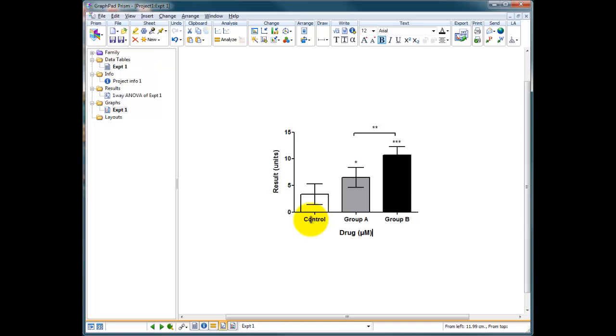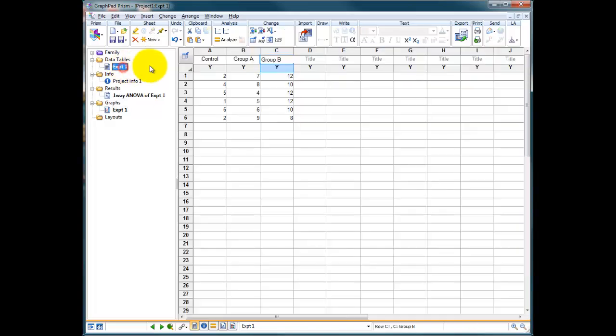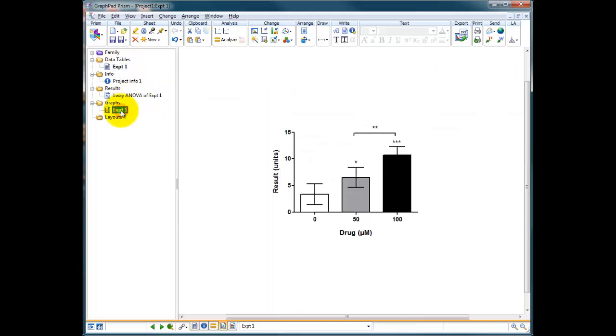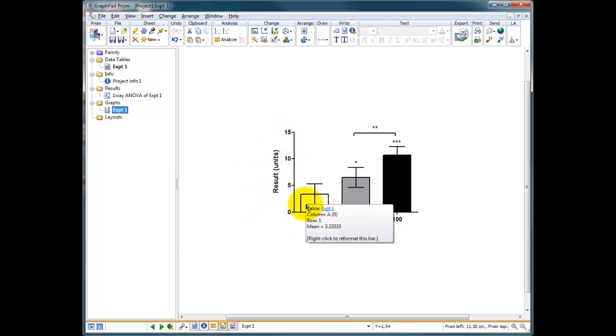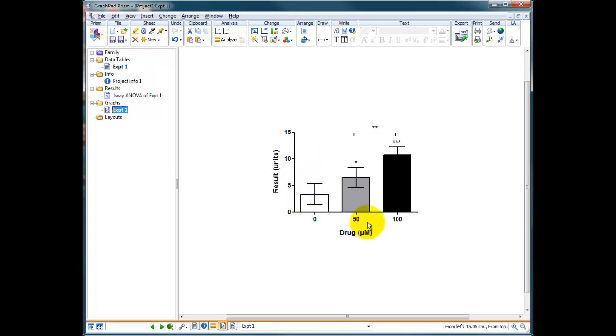Anyway, so we've now got drug in micromoles. We go to our experiment. This is no longer control, this is 0. This is now 50 micromole, this is 100 micromole, and our graph now reflects the drug in micromoles. Let's just say we repeated this experiment but this time we repeated it in the presence of an inhibitor that might inhibit whatever it is we're measuring in the result here. So this would be a slightly more complicated graph. It would be a graph where we have 0 plus and minus inhibitor, 50 plus and minus inhibitor, and 100 plus and minus inhibitor.